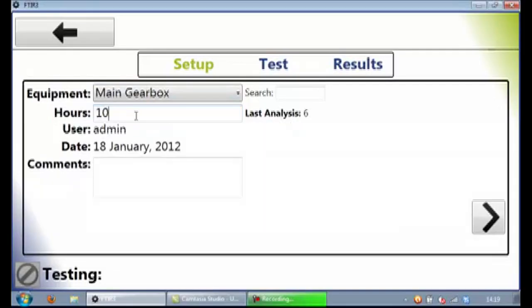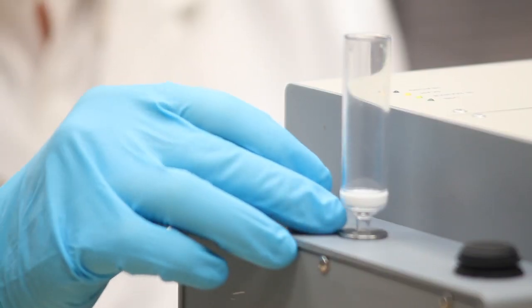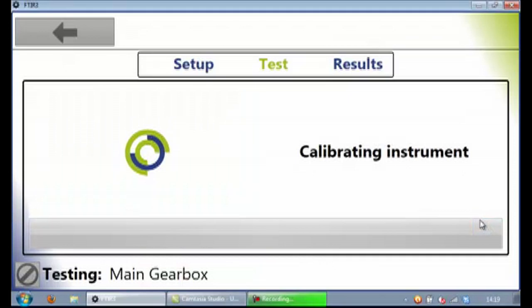Making a measurement is quick and easy using the supplied netbook and software. To take a measurement, first a background scan is taken.